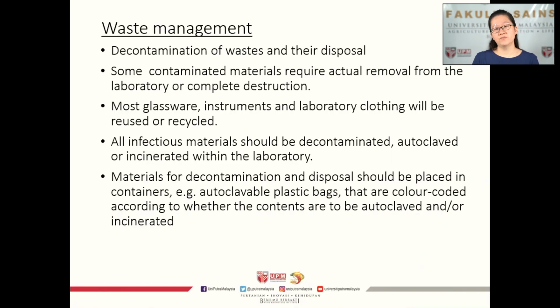One other key component of biosafety is waste management. In the laboratory, decontamination of waste and its ultimate disposal are closely related. In terms of daily use, some of the contaminated material requires actual removal from the laboratory and complete destruction. And in most cases, glassware, instruments, and also laboratory clothing are normally recycled.